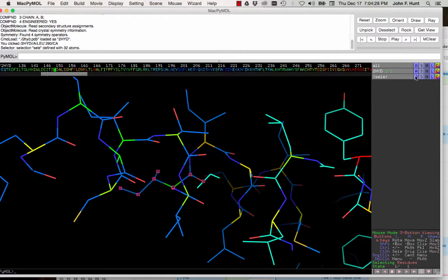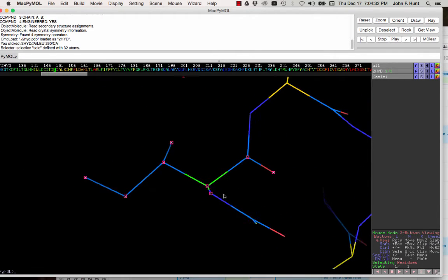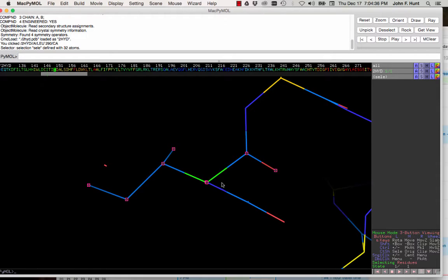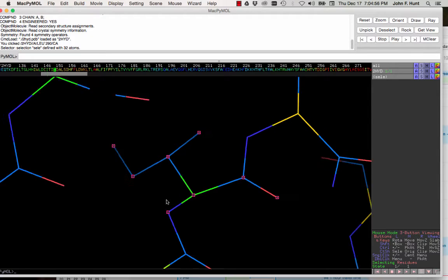Let's see if I zoom in on this, whether it gets too magnified. That's a little magnified, but I think that's actually going to work for us. So we have this N-C alpha. We're now looking down the N-C alpha bond. If the NH were, the 0 of phi, we'll have the C alpha C, right? So we want to look at the angle of this C alpha C bond relative to the NH. Now, one problem here is it's a crystal structure.